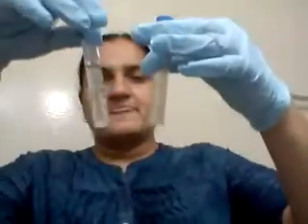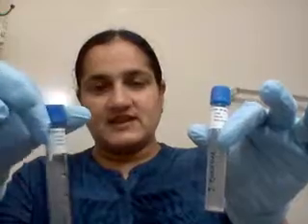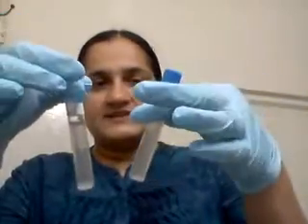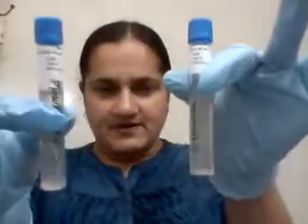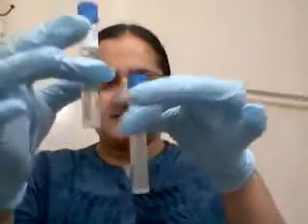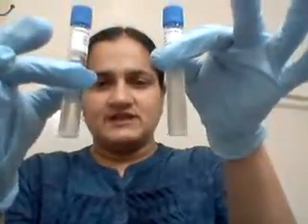So what I observed was that in the 1% salt solution for both yeast, that is baker's yeast, and S. epidermidis, I see the 1% one here, and this is the 1% sodium chloride. So you can see in the base there is a little bit of slight microbial growth and very slight turbidity. So that shows me that 1% NaCl is preferable for both the microbes.